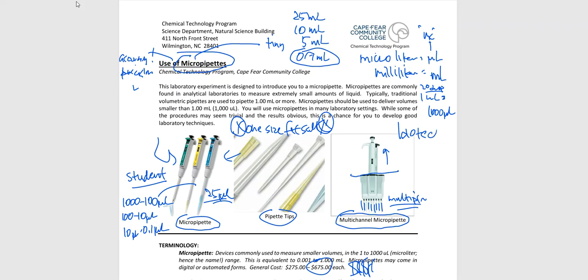This is really the world of biotech or biochemistry in a way. Whenever we're working with things like DNA or RNA or protein type of work, maybe I'm doing PCR, whatever the case might be, very often I am required to do multiple sample preps of these things. And if that is the case, that is fine.